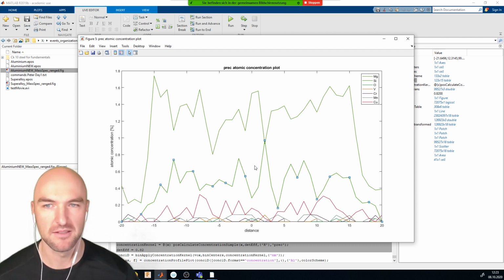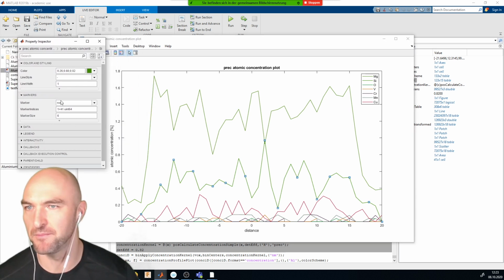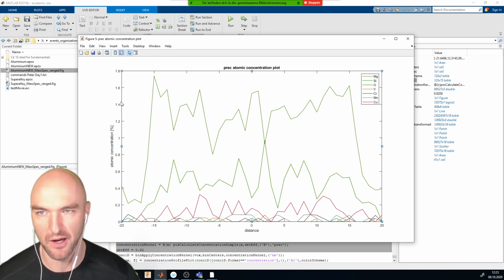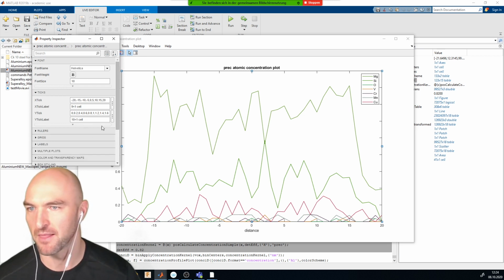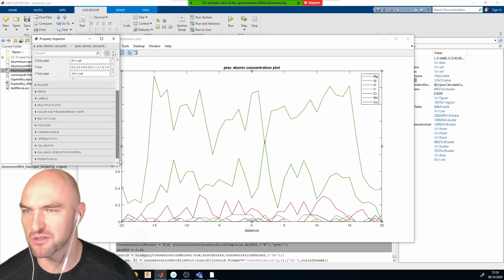Oh yeah. So you can change the plot type. Yeah, or bars, I guess. If you go to the interpolation and actually change that to what you call a stairs plot, that's actually perfectly possible. But anyway, so you've got all of what you need here. You can do all of the things that you're used to with your MATLAB plot. So you can go into the property inspector of the axis, for example, and change the y scale to logarithmic, and do any of those funky things.